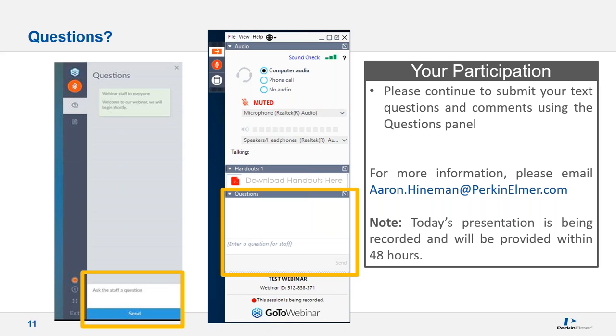This customer says, our lab has an Avio 200, but I never use MSF. Can I get the detailed operating manual or document for MSF? Yeah, we can send you a link to some of that. It's actually in the help menu. If you go into the examine window, go into MSF mode, and hit F1, it'll bring you into the help menu, and it does have a description of that. In addition, coming up in a few weeks, I'll double check the date, we have a webinar specifically on MSF, with a little more detail on metallurgical application and how MSF was used. So just a good question.